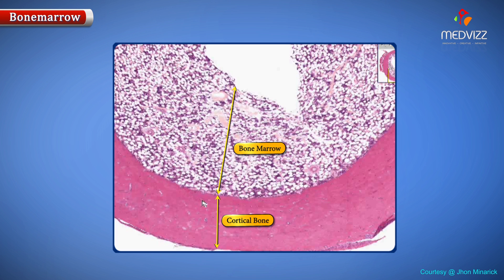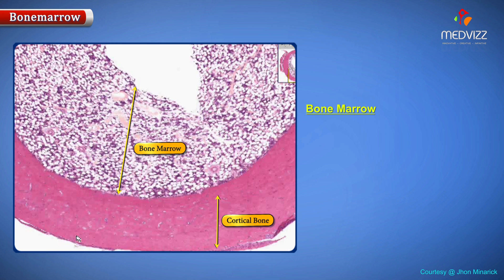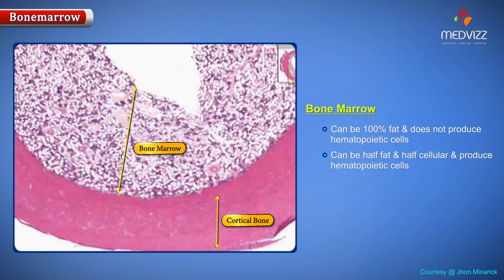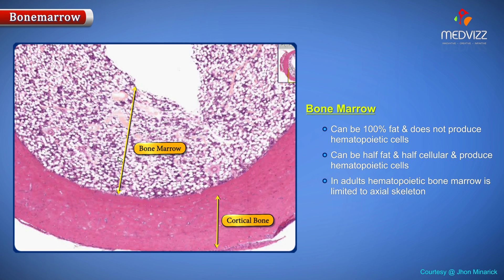In addition, bone has marrow. Bone marrow can be 100% fat, in which case it will not make hematopoietic cells. Or bone marrow can be approximately half fat, like you see here, and half cellular, which is the normal general ratio for hematopoietic bone marrow. In adults, hematopoietic bone marrow is primarily limited to the axial skeleton, and the appendicular skeleton, the distal extremities, is primarily non-hematopoietic marrow, or 100% fat.